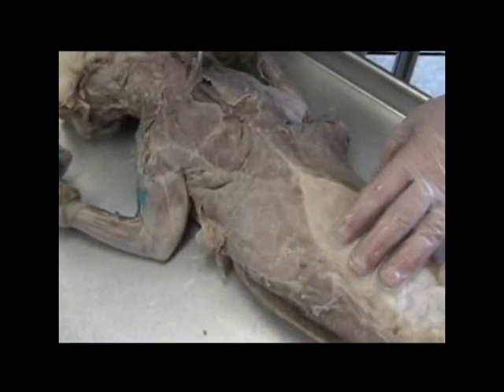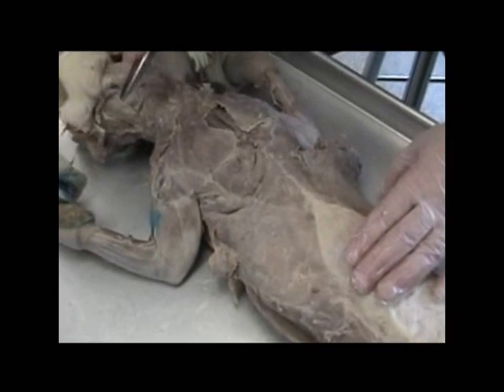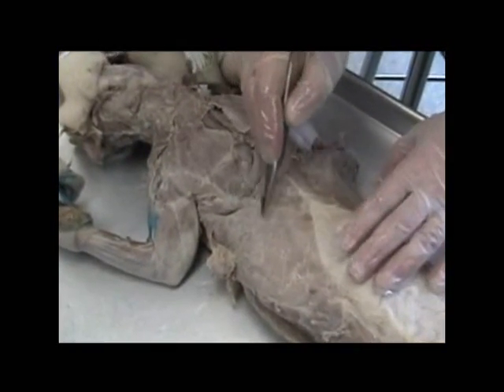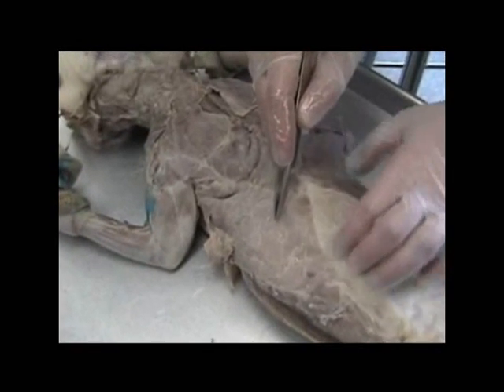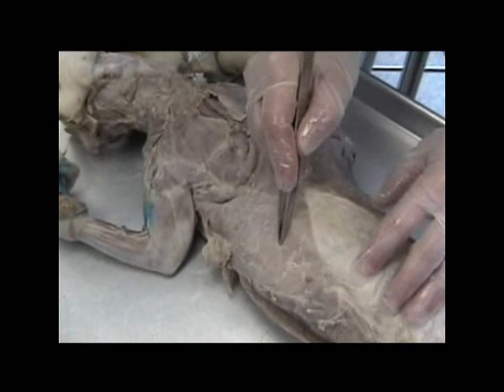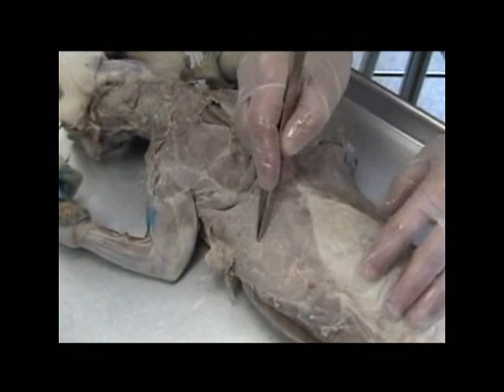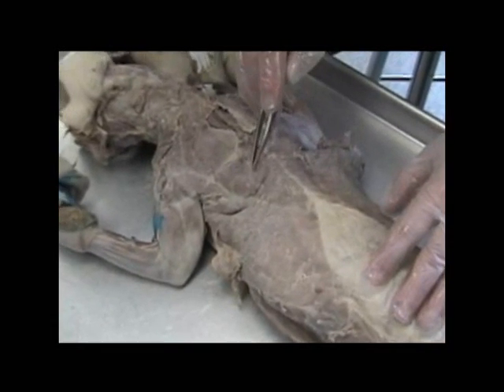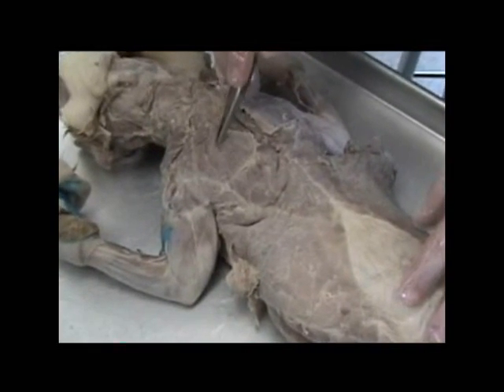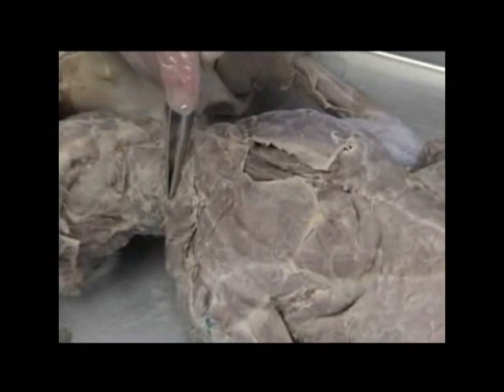We're now going to do the superficial shoulder muscles. We're going to start posterior and work our way anterior. The most posterior of these muscles is the latissimus dorsi, a big sheet of muscle commonly called the lats. This is the latissimus dorsi. Then the spinotrapezius, the acromiotrapezius, and up on the neck, the clavotrapezius. So those are the big trapezius groups: spinotrapezius, acromiotrapezius, and clavotrapezius.